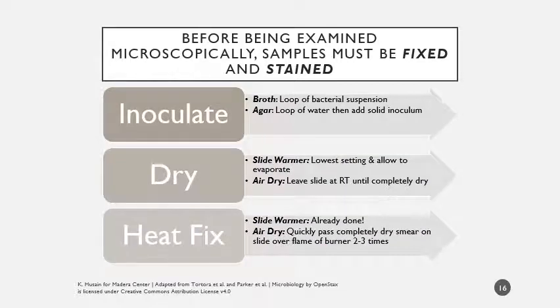So like we talked about in lab yesterday, a sample has to be fixed and stained prior to examining it microscopically. When we say inoculation, that can be used as a kind of old-timey word for vaccines. Inoculation is introducing some bacterial or viral specimen, which might be alive, might be dead, might be able to cause disease, might not be able to cause disease, might start an immune response but not cause disease. You're introducing some form of microbial life.